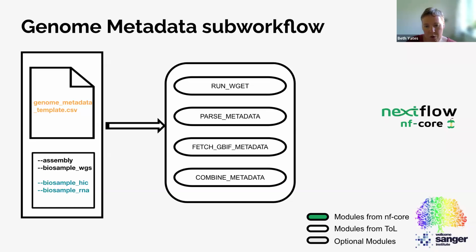And if all of the sources agree, if the value from each of the sources matches, we'll put that into a file for consistent data. But if one of the sources has a slightly different value to the others, that will go into a separate file for inconsistent information.